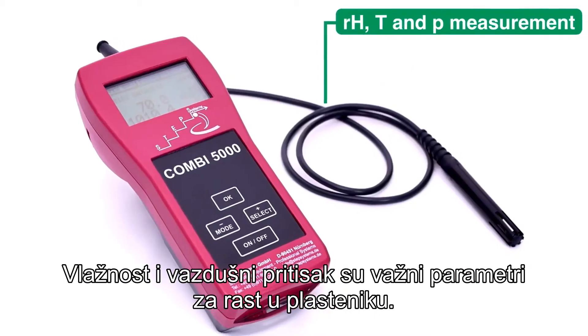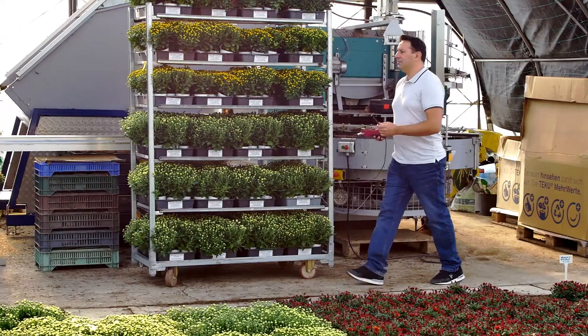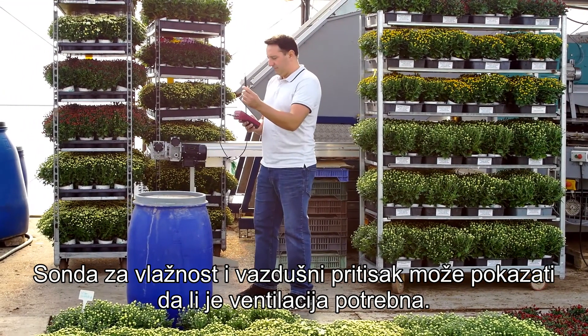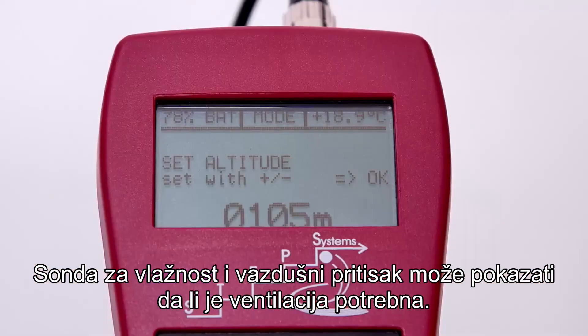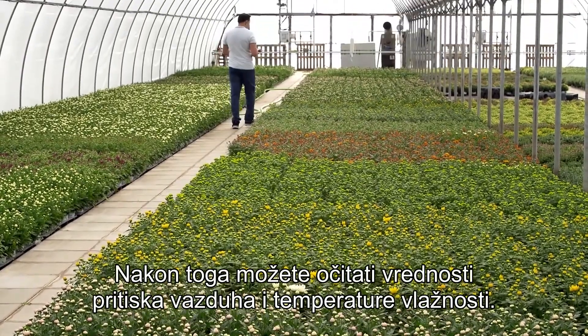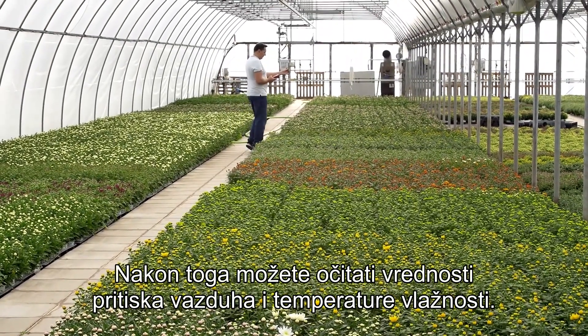Humidity and air pressure are important parameters for growing in a greenhouse. The humidity and air pressure probe can indicate if ventilation is needed. For precise measurements, set the altitude on the device. Afterwards, you can read the humidity, air pressure, and temperature values.